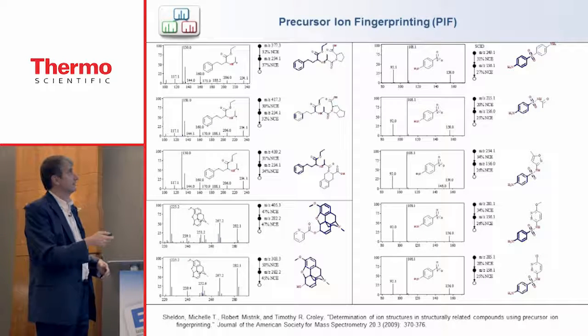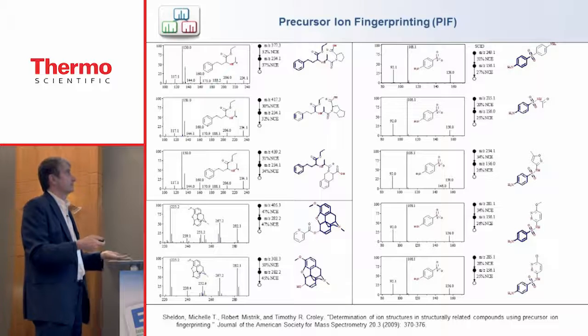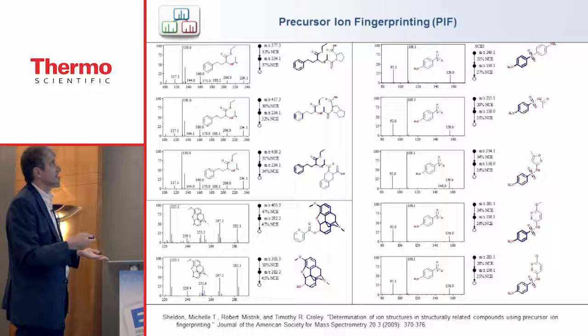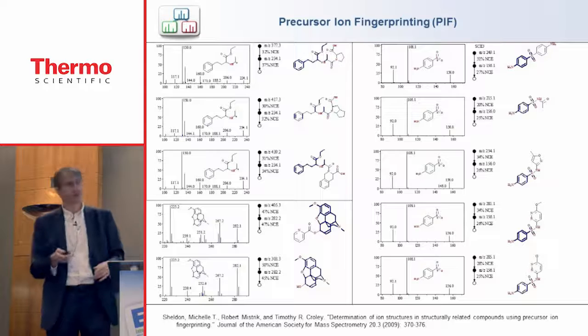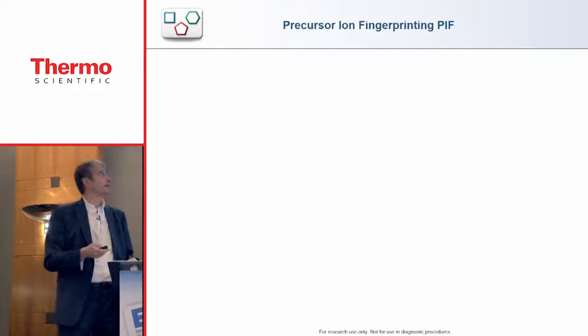And this slide actually shows that it really works. Here we have different compounds that yield the same fragments, and we have matching spectra. Another example, and another example. It works well for positive and negative electrospray.